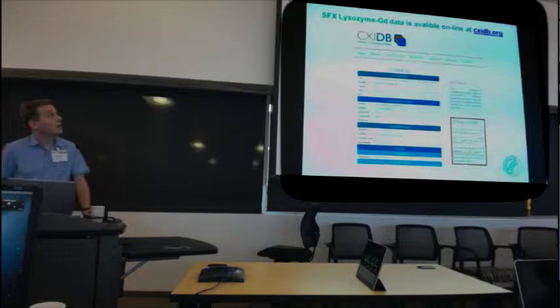I hope that you are following all the steps that I'm going to do, and that you will be issuing all the commands that I'm going to issue. I will try to do it very slowly, and whenever you have a problem or you are not following, you can raise your hand, and then I can repeat this step. And we have lots of time, so it's okay.